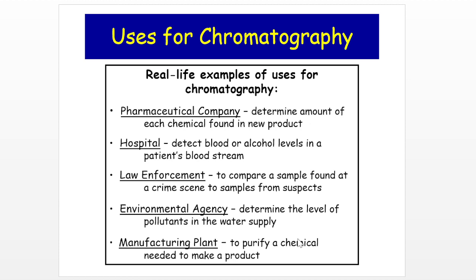Now, the application of chromatography. Real life examples of uses of chromatography. The first one is the pharmaceutical company. In a pharmaceutical company, we use chromatography to determine the amount of each chemical found in a new product. In hospitals, we use chromatography to detect blood alcohol level in the patient's bloodstream.